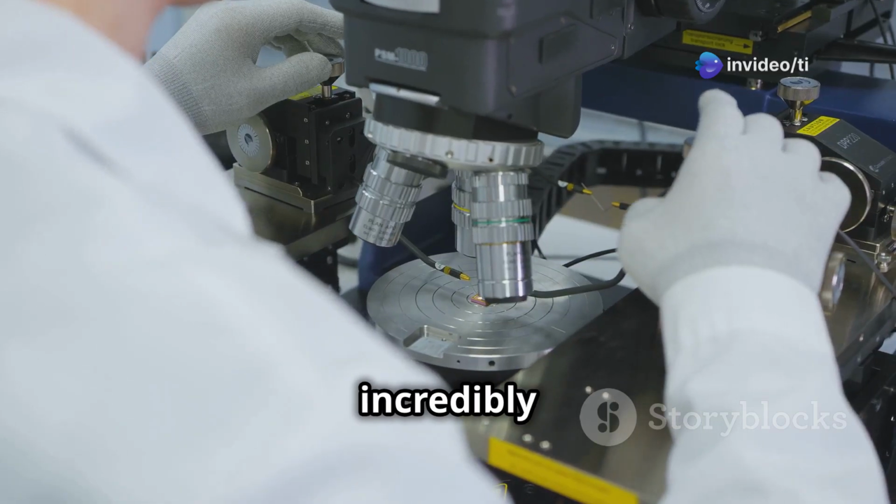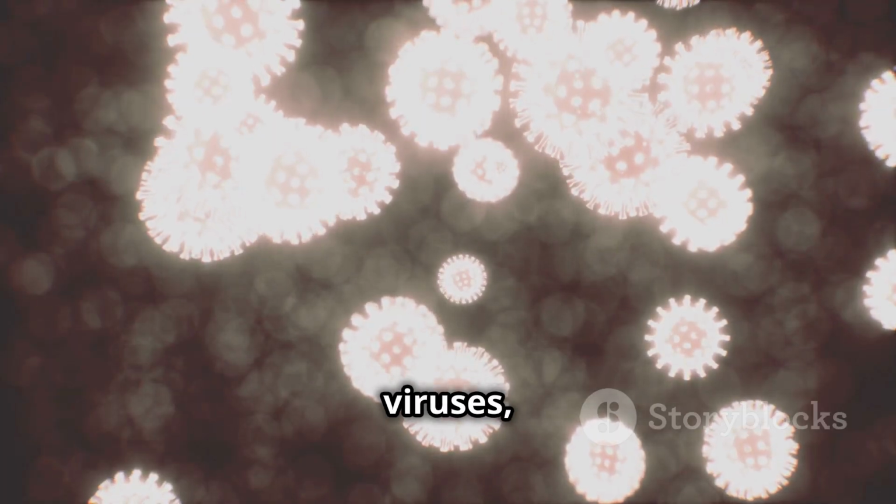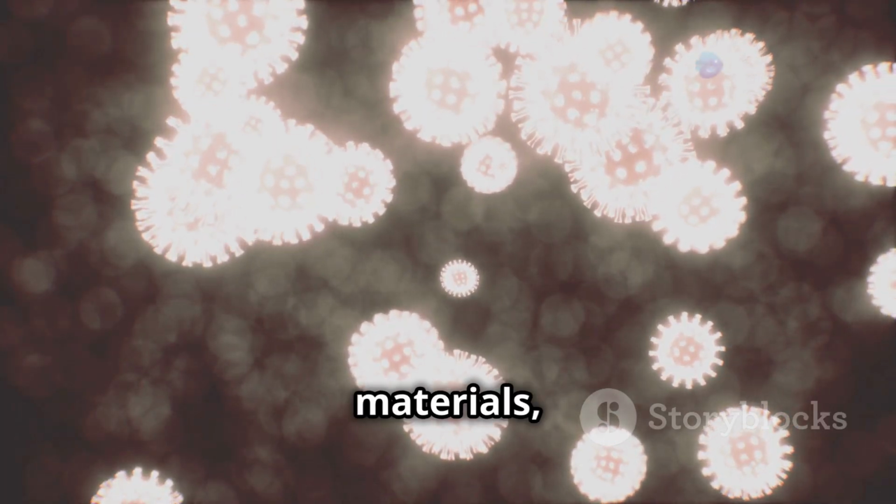Electron microscopes are incredibly powerful tools for scientific research. We use them to study viruses, the inner workings of cells, the structure of materials, and so much more.